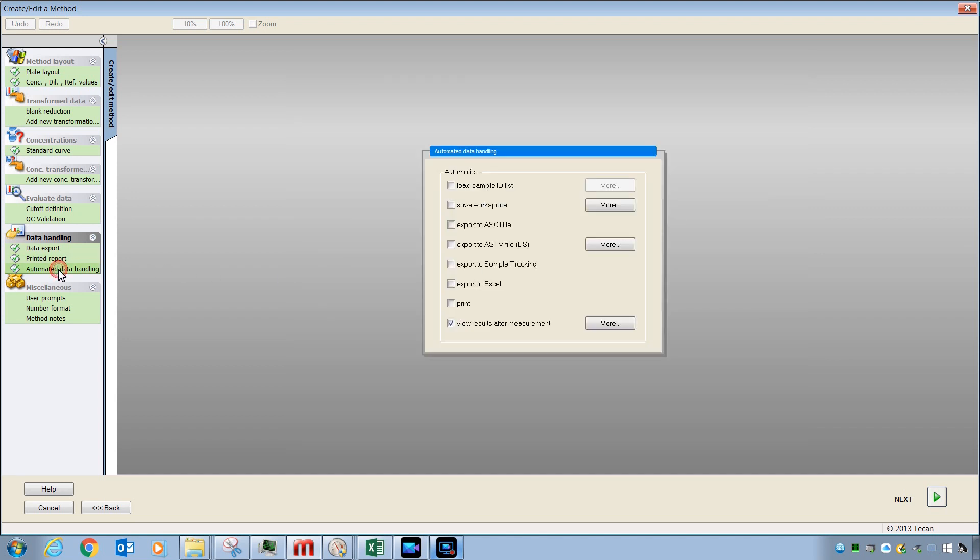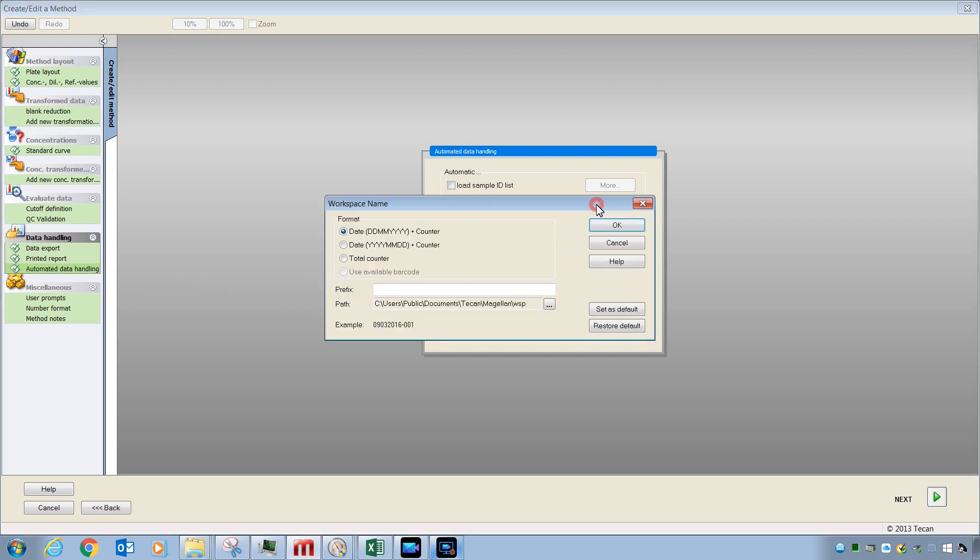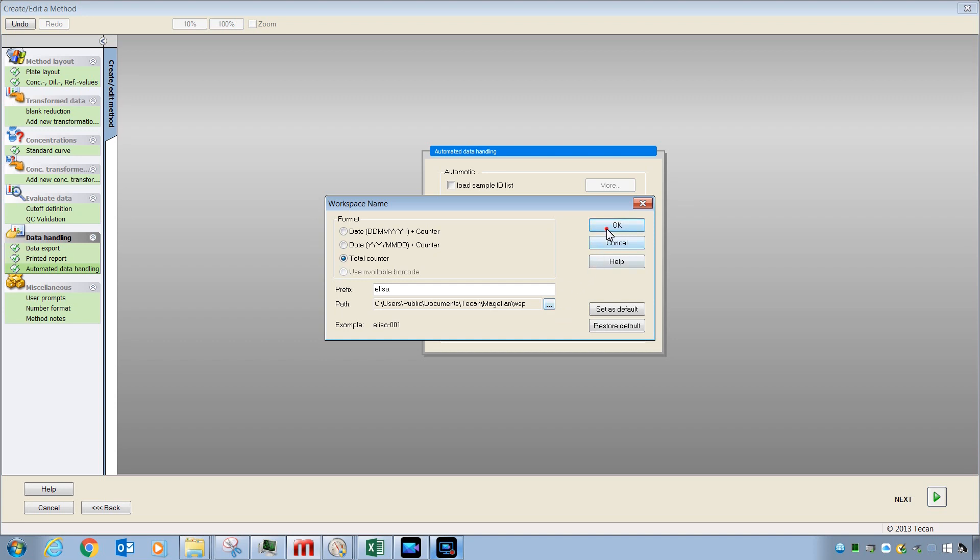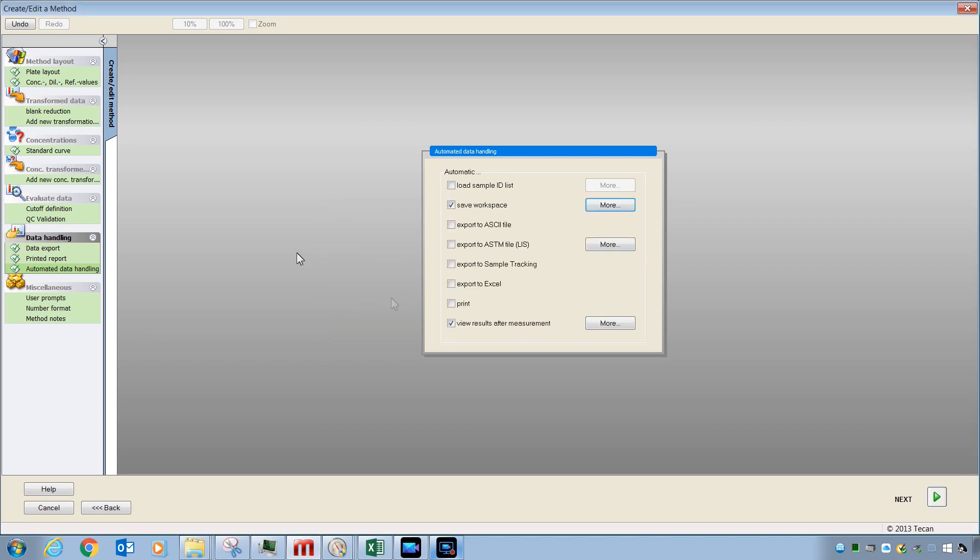Lastly, we're going to look at automatic data handling. This is where you will want to check to save your workspace and also give your workspace a name. There are a variety of different formats that you can use with the name. When you click one like this, you can see an example of what that format will produce. You can also pick which path you want to use on your computer for the file to be saved into. If you want to export to Excel, you'll click this and if you want to view the results or print the results at the end, make sure you check these boxes as well.